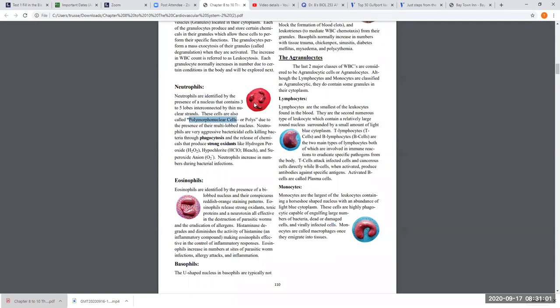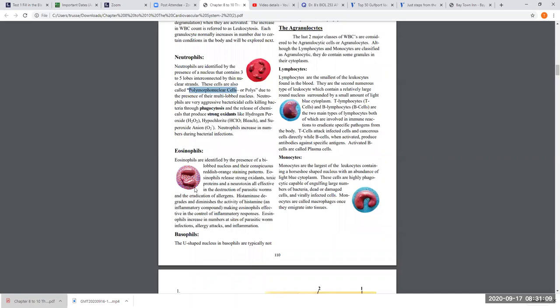Eosinophils have red to orange staining granules in their cytoplasm because the chemicals in their granules take up an acidic stain called eosin — thus the name eosinophil. The other identifying character for a mature eosinophil is that they always have a bilobed nucleus — it looks like two separate lobes, sometimes two nuclei, but it's really one nucleus with two lobes interconnected.